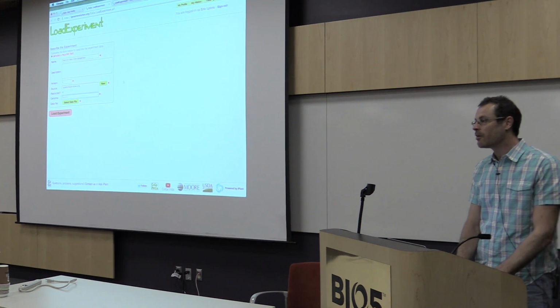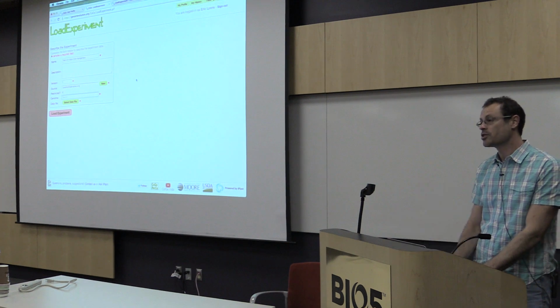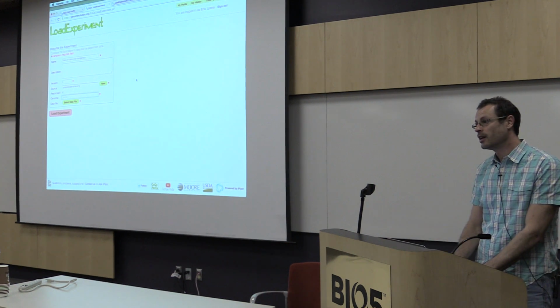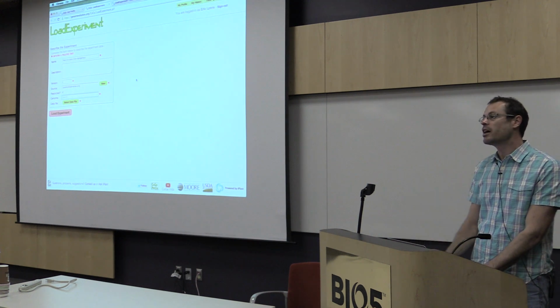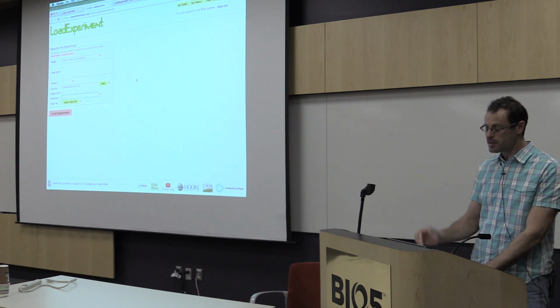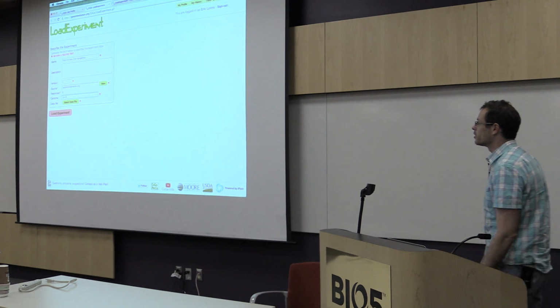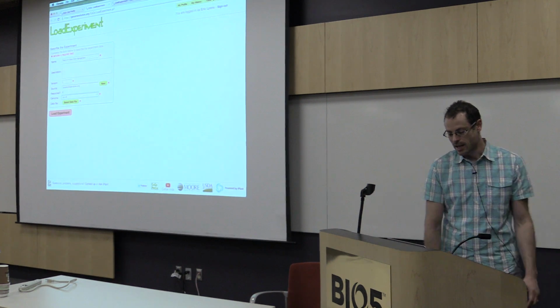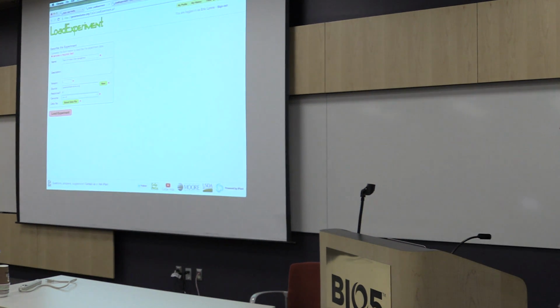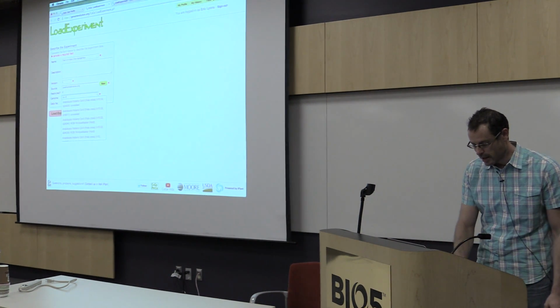Genome, now we're going to have some fun. We've got to go search for Arabidopsis thaliana and a specific version of it out of 20,000 genomes inside the system. So you can just start typing in an organism name, but the fastest way to find it is going to be type in col-0 or Columbia-0, which is the typical genome. Give it a moment. It's now going to go hit the database, and we're probably all hitting it at about the same time. And it's going to come back with a list of genomes to select from.